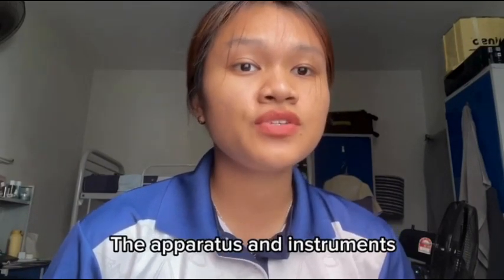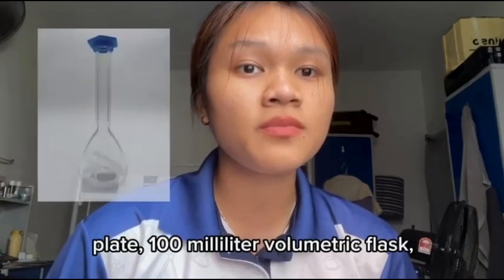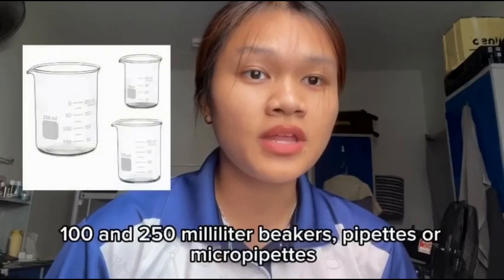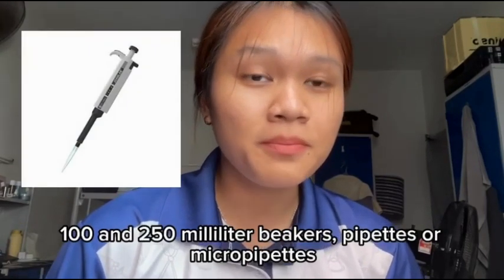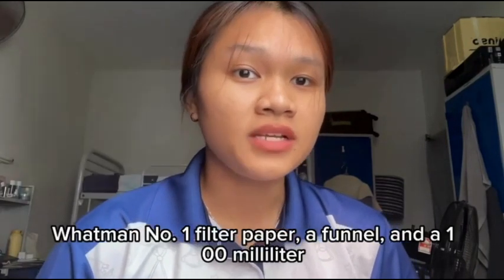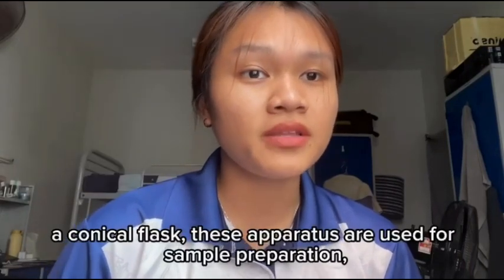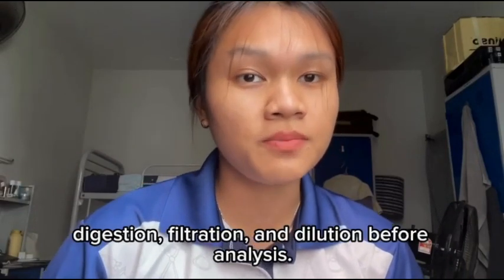The apparatus and instruments used include an analytical balance, a hot plate, a 100 ml volumetric flask, 100 and 250 ml beakers, pipettes or micropipettes, Whatman number 1 filter paper, a funnel, and a 100 ml conical flask. These apparatus are used for sample preparation, digestion, filtration, and dilution before analysis.